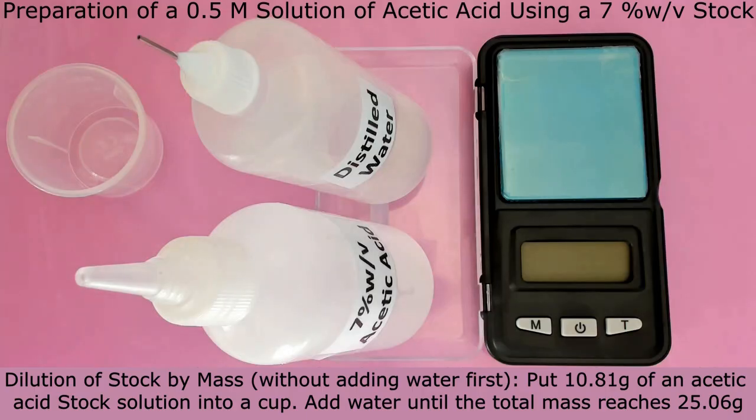In this part of the video we will prepare 25 milliliters of a 0.5 molar acetic acid solution. We will use a 7% stock solution of acetic acid. We start with 2 bottles. One contains distilled water. The other contains 7% acetic acid. We also use a digital scale that shows weight in grams, with 2 decimal places. The required amounts have already been calculated using the CHEMIX School Preparation of Solutions calculator.